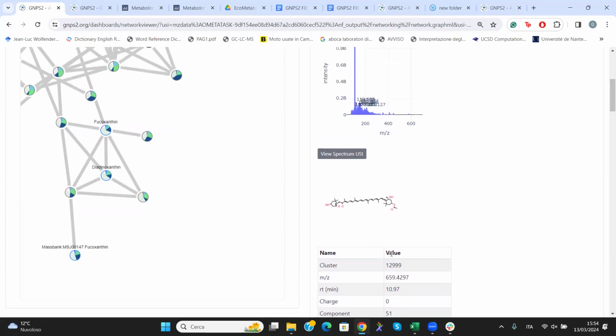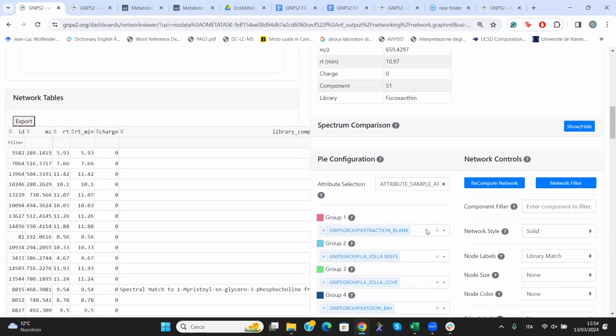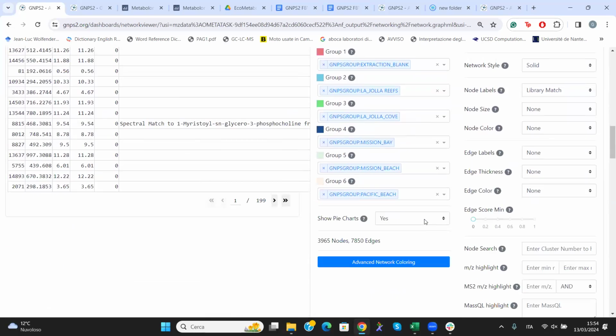And any question about that? Everyone understand anything? Yes? Yeah. No. Whenever you click out of the box, maybe it's just slow. Yeah, that's the thing.